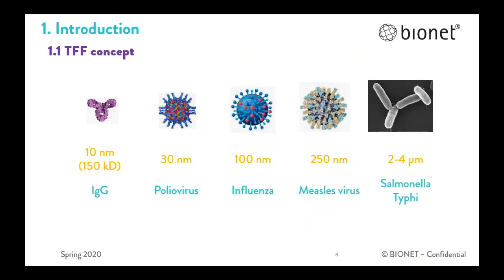Most bacteria are between 0.6 and 4 microns in diameter, so they can be seen with an optical microscope, while viruses, notably smaller, can only be detected by electron microscopy. In that sense, microfiltration would be enough to retain bacteria, but in the case of virus, UF is absolutely necessary.